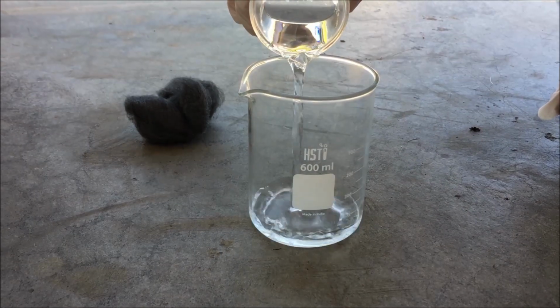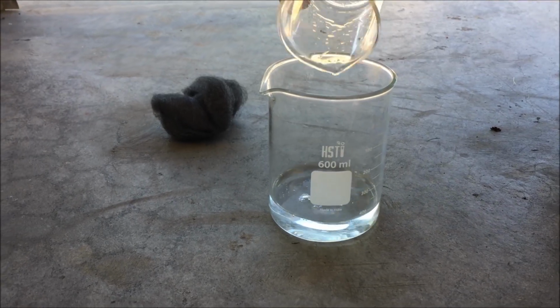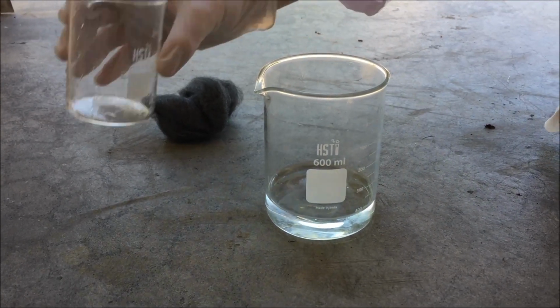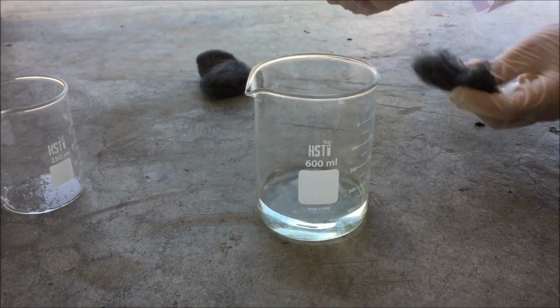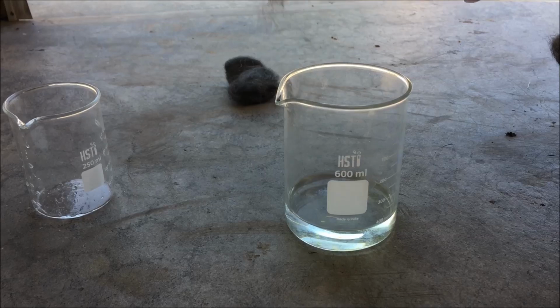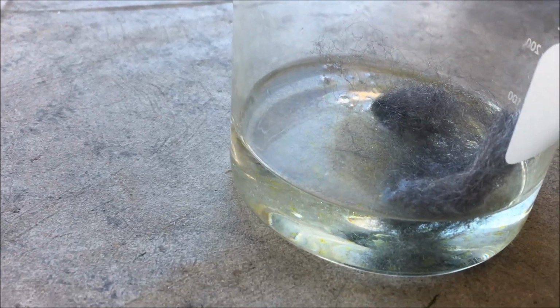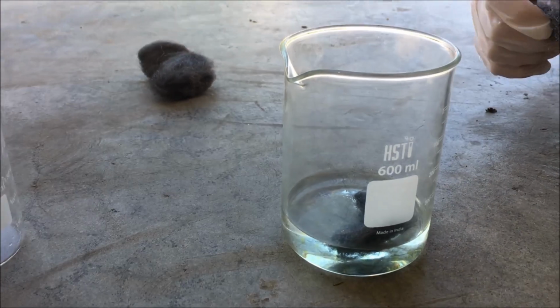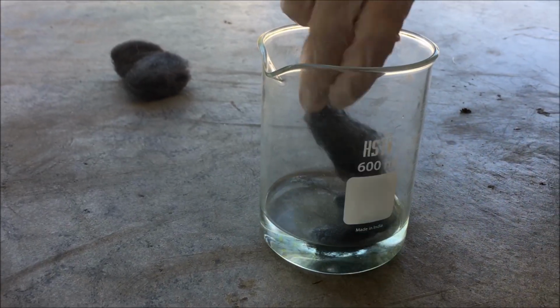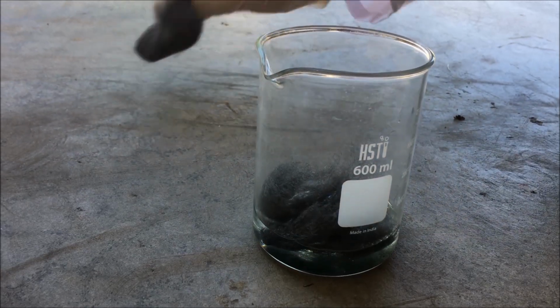I then added the acid solution into a larger beaker so that the steel wool would dissolve better into the acid. I then added around 10 grams of steel wool. Here, the iron in the steel wool is turning into iron 2 chloride and it is releasing hydrogen gas.